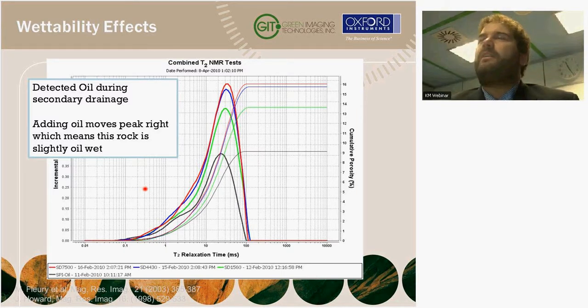So what is deuterium oxide? Well, it's just regular water, but the hydrogen happens to have an extra neutron. What does that do for us? From an NMR perspective, that particular type of hydrogen gives us no signal. So the hydrogen becomes invisible. So we conduct the experiment with D2O, deuterium oxide. We won't see the water, we'll only see the oil. So we're not worried about overlapping peaks, as I described earlier.